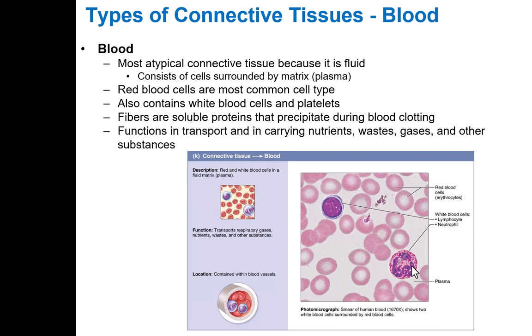All right, so those are the connective tissues. And again, you do need to practice just looking at these tissues. And the key here is you are seeing more than just cells. You'll see a background, and in many cases, you're going to see fibers. That's a clue that it's connective tissue. And now your job is to go through all these slides over and over and over again until you can get a feel for which one is which.